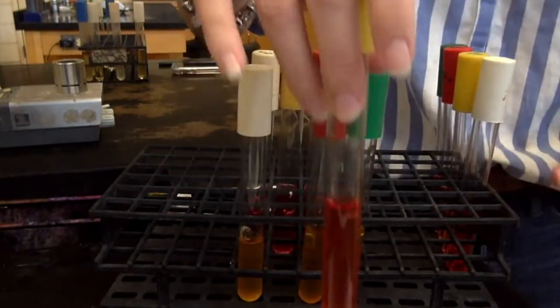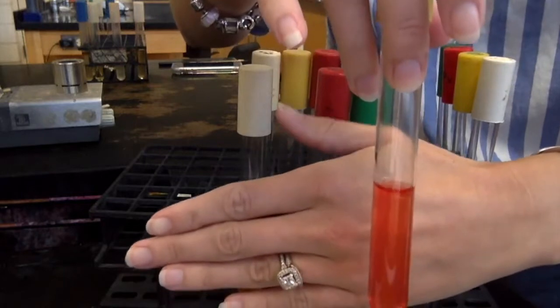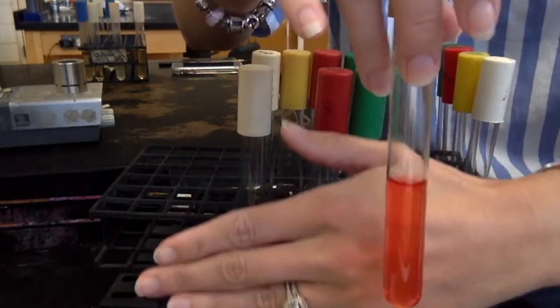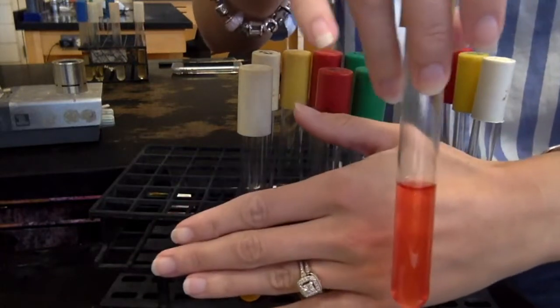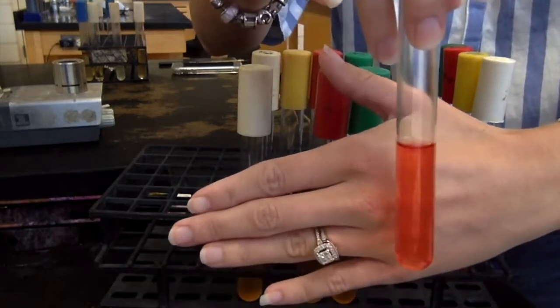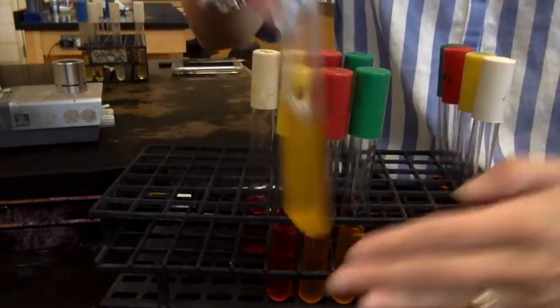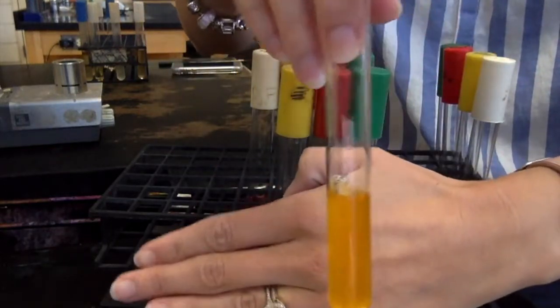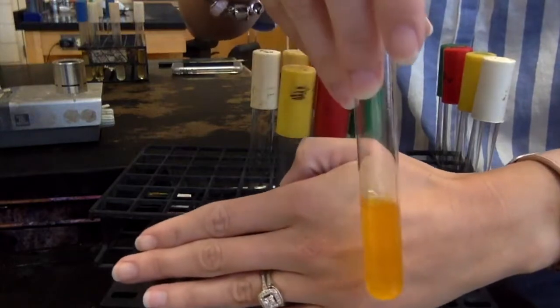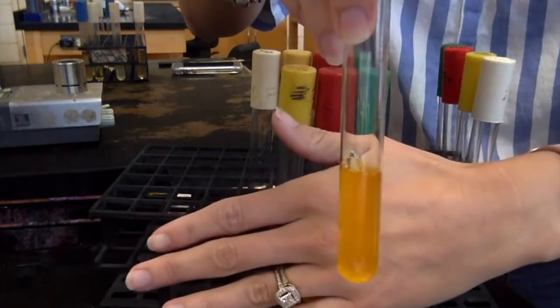Now, sucrose is red. So that's a negative reaction. So what this means is that E. coli cannot ferment sucrose. It does not have the ability to ferment the sucrose. And lastly, my mannitol. There's my yellow again. There is a gas bubble in there. It's just hard to see because my mannitol is kind of below the threshold of the Durham tube.